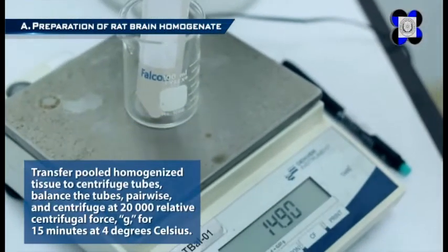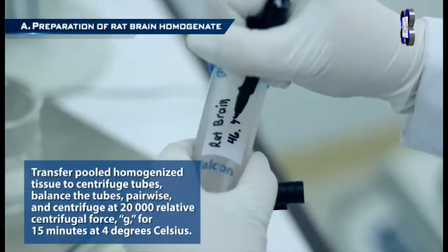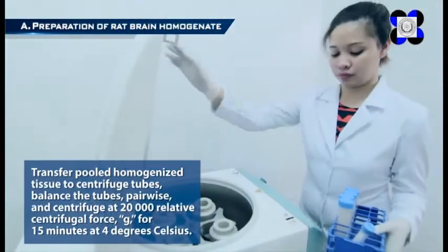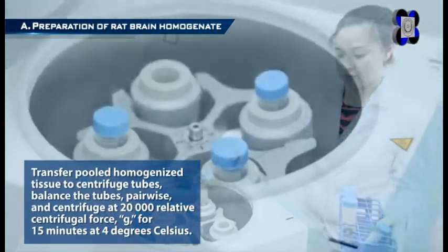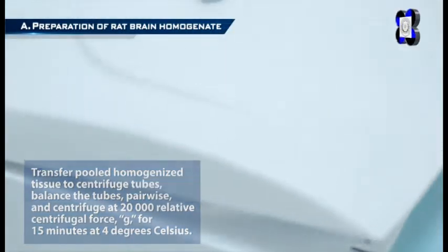Step 7: Pour the homogenized tissue into a 250 ml beaker on ice and repeat the procedure with remaining cortices. Transfer pooled homogenized tissue to centrifuge tubes, balance the tubes pairwise, and centrifuge at 20,000 relative centrifugal force for 15 minutes at 4 degrees Celsius.